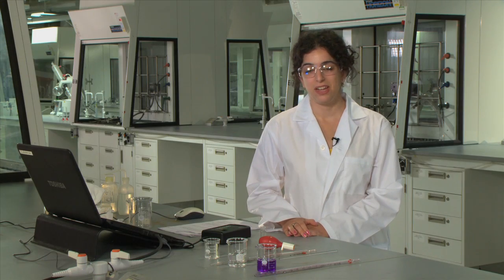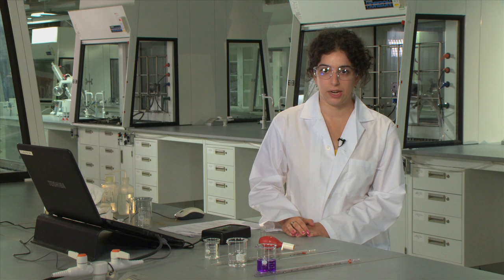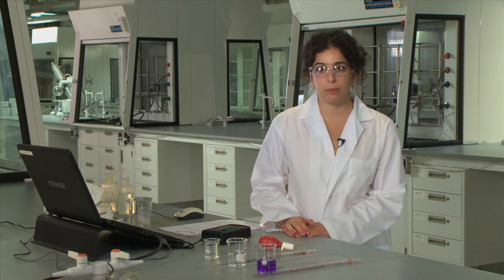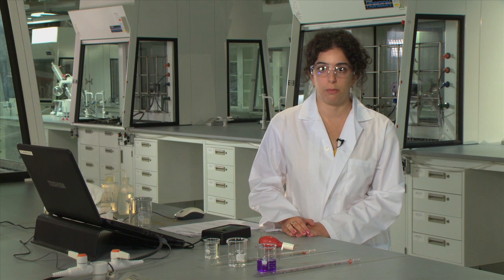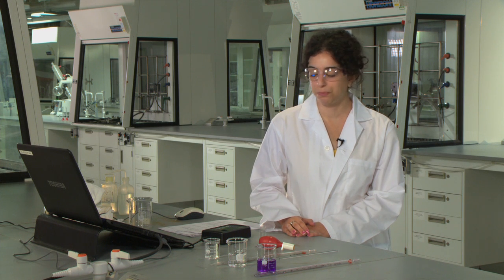Hi, my name is Amanda, and today I'll be talking about the experiment Chemical Kinetics. In this experiment, we will be looking at various factors that affect the rate of a chemical reaction.